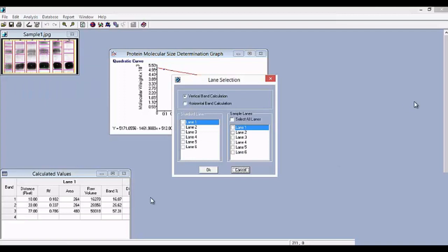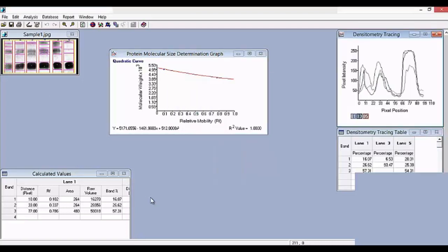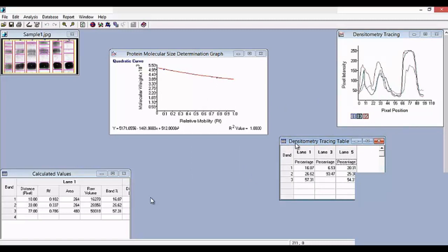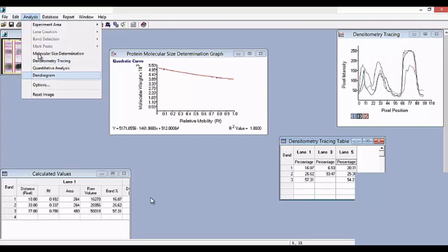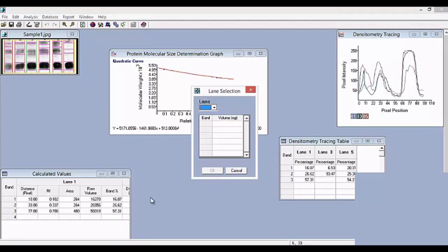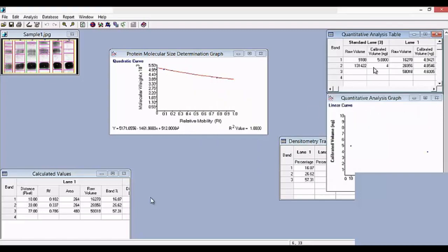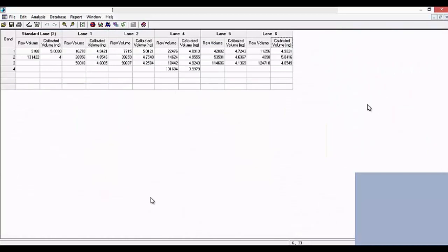Go to Analysis, then Densitometry Tracing. In densitometry tracing, you can select all the lanes or choose individual lanes — lane 1, lane 3, lane 5 — for densitometry tracing. After that, when you click yes, you can see the densitometry tracing curve and also the densitometry tracing table. Go to Analysis again, select Quantitative Analysis, and choose the standard lane. Enter the values for the marker or standard lane — I am entering 5 and 4 for band 1 and band 2. We can now see the quantitative analysis table and graph. Once you enter the value for the standard lane, the values for the remaining bands in all lanes are calculated automatically.